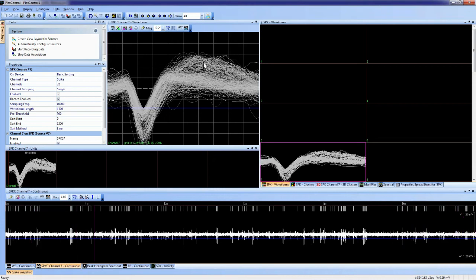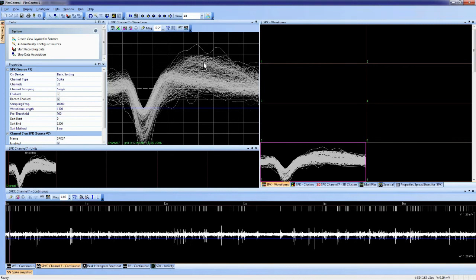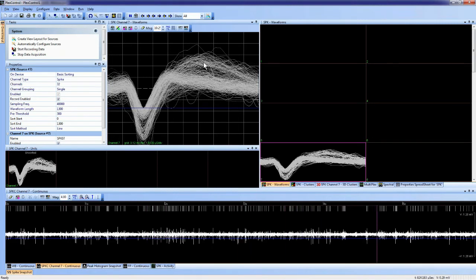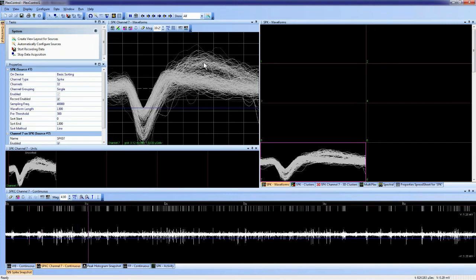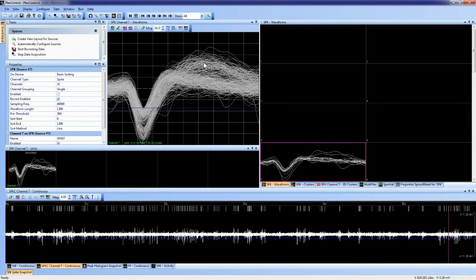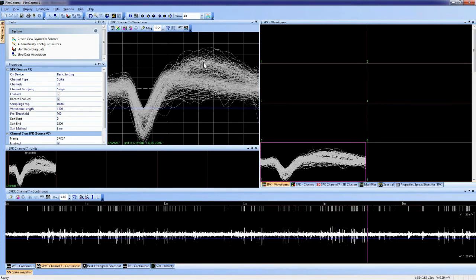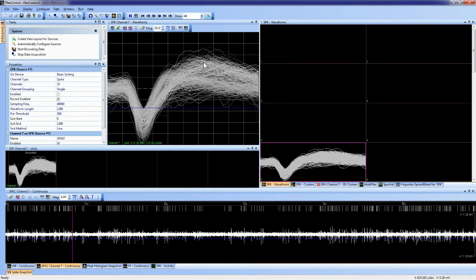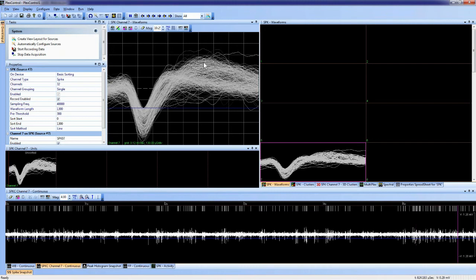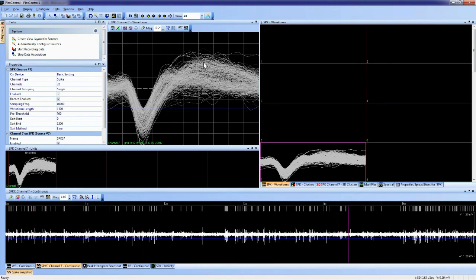The position of the threshold and waveform length, pre-threshold length all stay the same. What is different now is the waveforms are aligned to the maximum signal, not the threshold crossing. This can be useful for better separating spikes without changing the threshold. This can also be useful for spike sorting. Whether or not standard or aligned extraction is used will depend on how well isolated the data is, the noise level, how detailed the spike sorting must be, user preference, etc. So that was a demonstration of manually setting the threshold using the standard and aligned extraction methods.